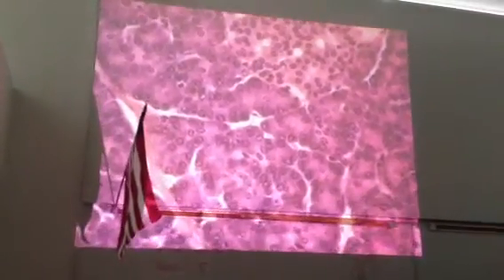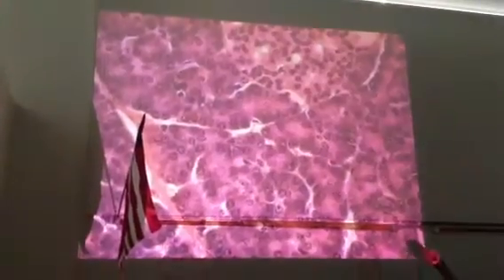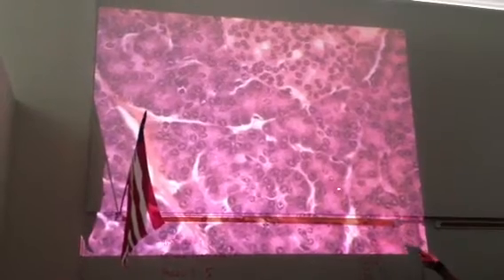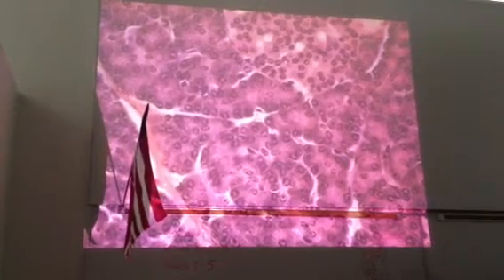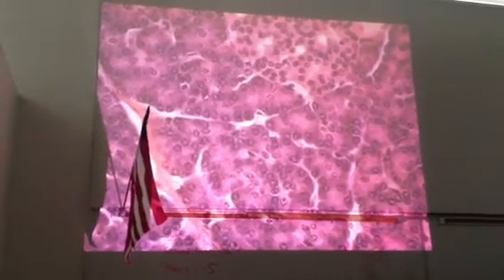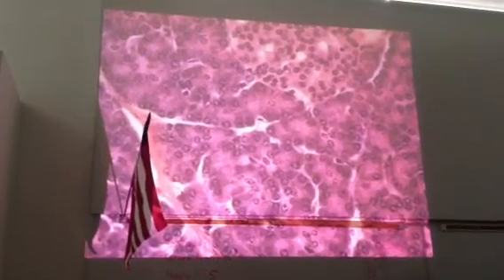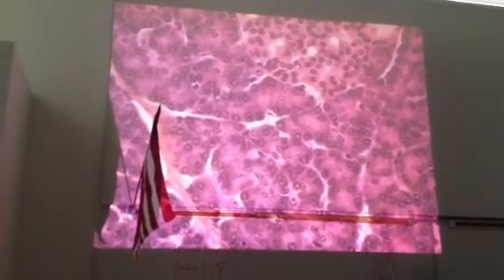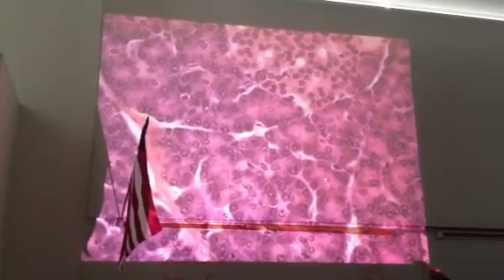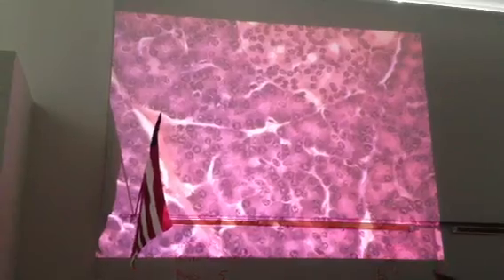As I've stated before, a key feature of this, the cells are pie-shaped, and this would be like an acinus right here. It's dark around the periphery because the nucleic acid in the nuclei and the nucleic acid in ribosomes for making these proteins stain with the dark portion of the dye. It's light to the center because we've made these zymogens. We've made these digestive enzymes, and the protein stains with the eosin part of the dye, and it stains pink. So, there's an acinus, this is an acinus, that's an acinus, here's another one right here, and that's where we produce our digestive enzymes.